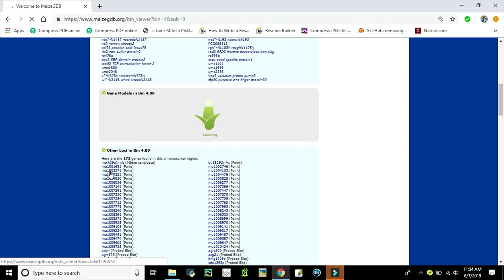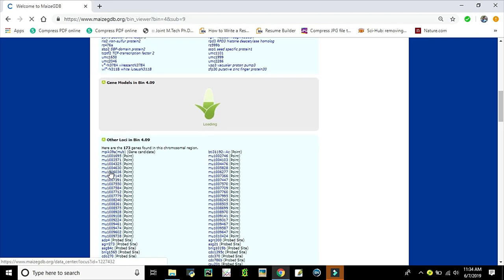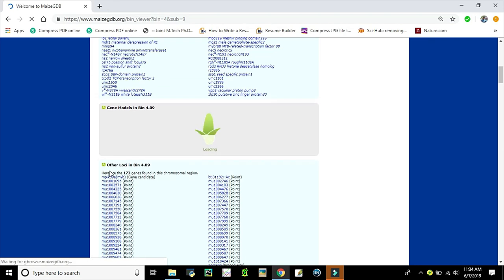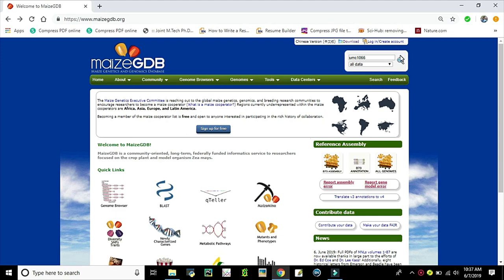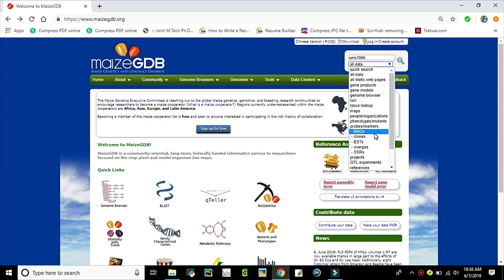Now we are in the last topic of the video: SSR marker information retrieval. In the top right corner of the home page lies a search option. Here, the marker name has to be entered, such as for example UMC1066. Then select 'All Data' or 'SSR Markers' from the options given below. 'All Data' will give all the related information regarding the query. When selecting 'SSR Markers', the information is retrieved only for the particular SSR marker name.